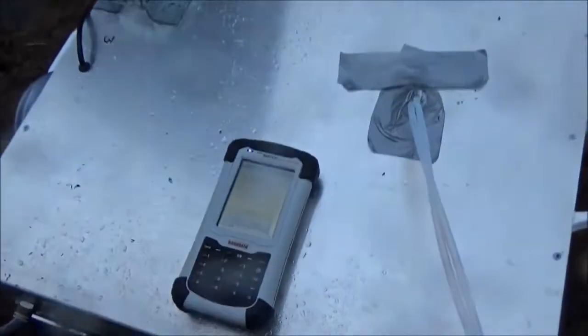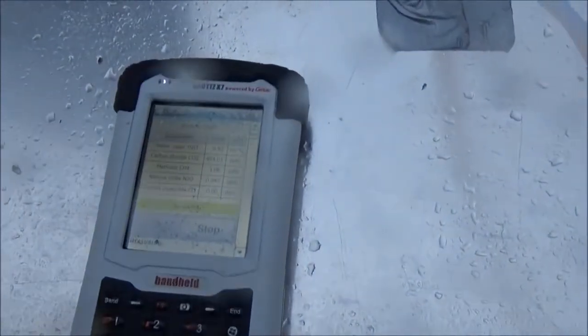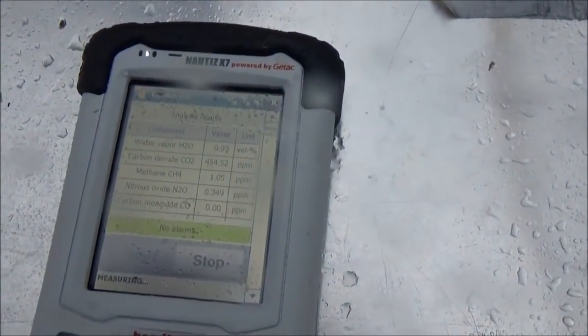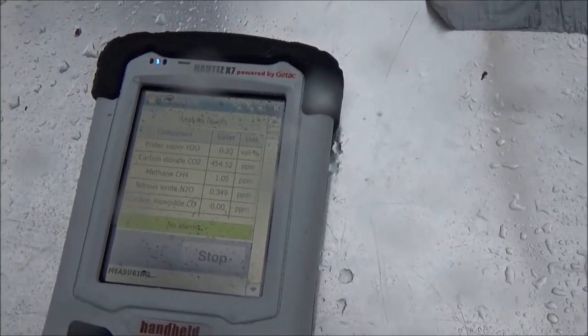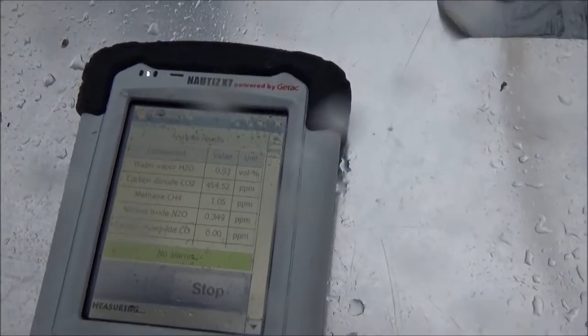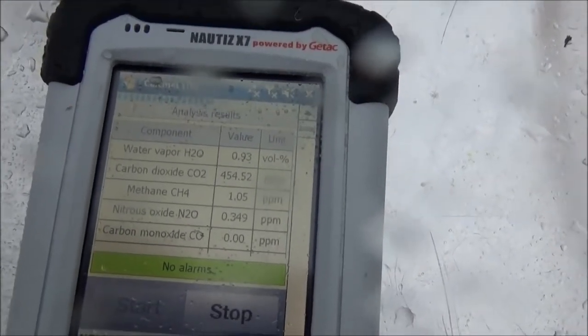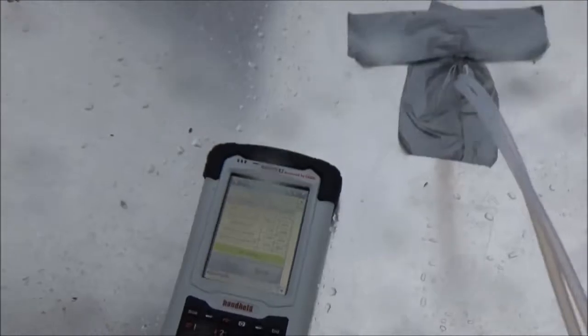Actually there is also CO2 increasing, but only very little, so I don't think there is much microbial activity in the soil. It's bare soil and it's been open for a long time, so all the activity has gone. But we will wait a short while, a couple of minutes, and then we'll know.